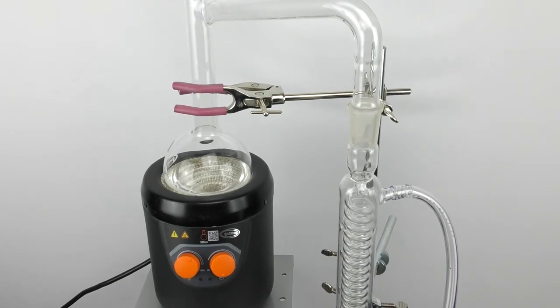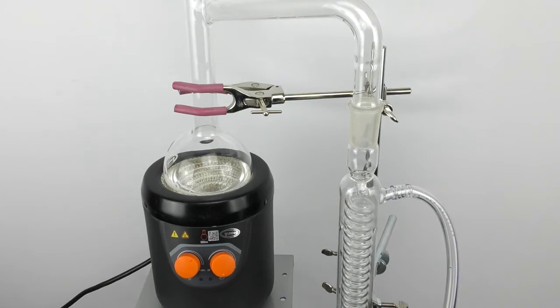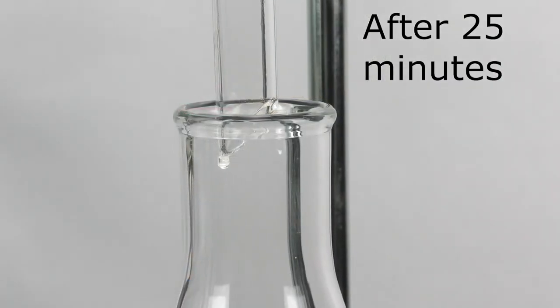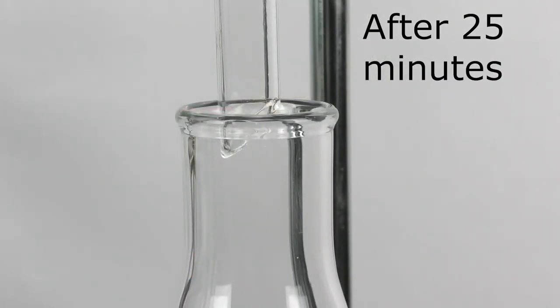But now this is going, I'm going to turn on my cooling system. And here we have our first drip forming from our distillation experiment.